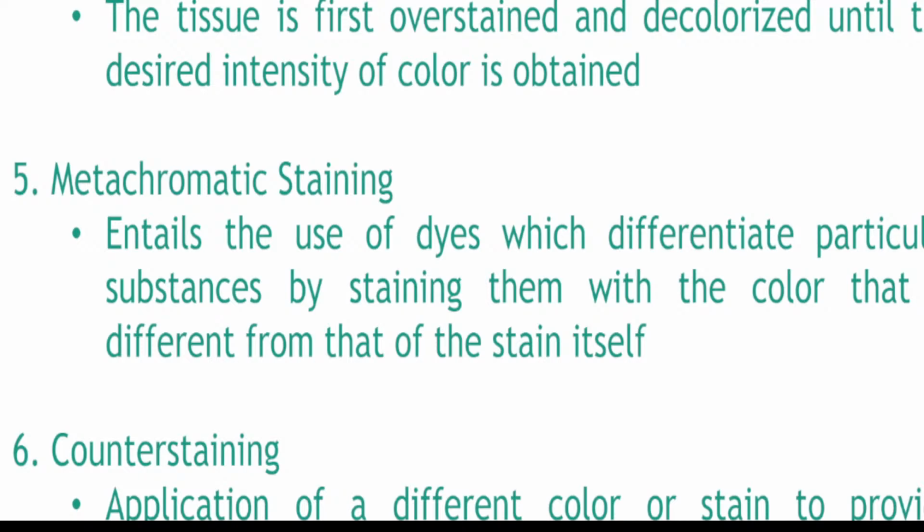Okay? All right. So counter staining. The stain provides a background. What's another example of counter staining? Nigrosin dye, right? So what does nigrosin do? Or India ink preparation? You stain the background, right? Yeast cells, if they are present, won't be stained. Because the yeast cells are the only ones that weren't stained, they come up prominently in a black background, right? So that's counter staining. Okay? So clear? Clear pa rin, nakakahabol pa rin tayo?